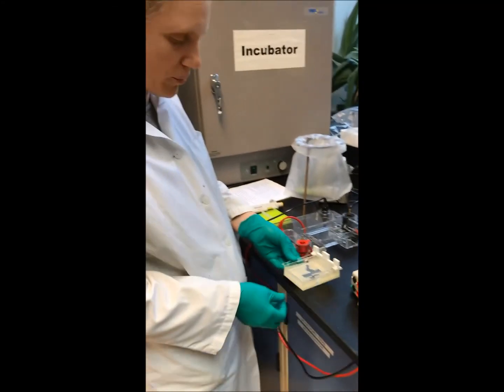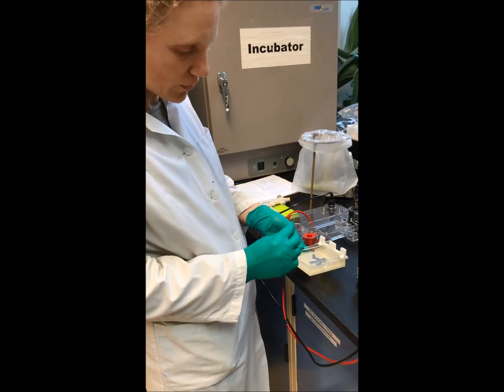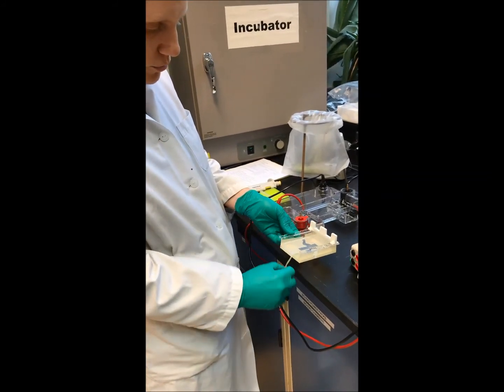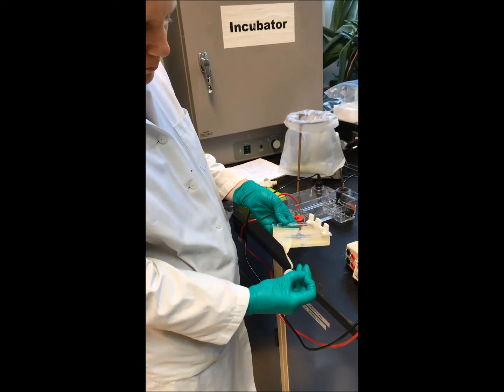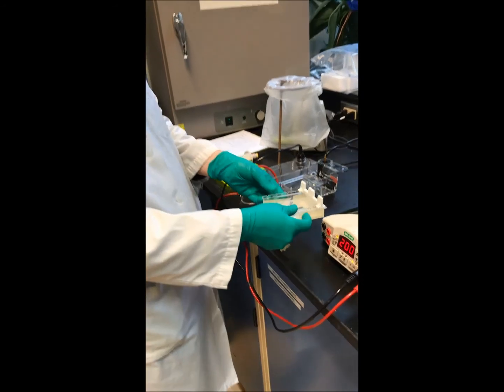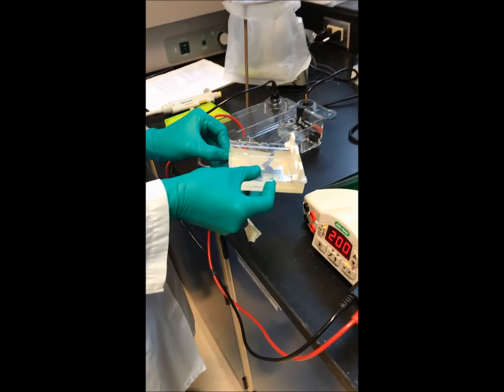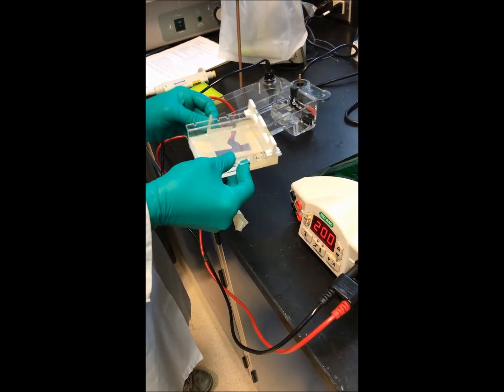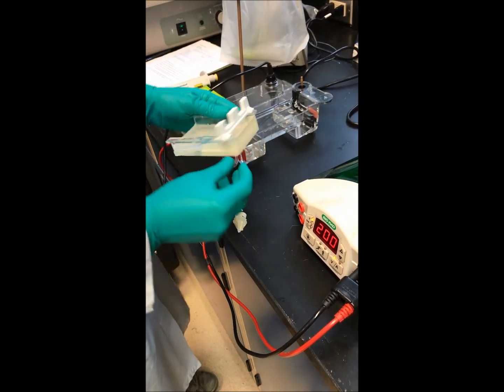Okay, so the gel has been poured. It's a jello-like substance, a rectangular slab, and to pour it we need to prepare the bed, the gel bed, so we have to put tape. Now I'm removing the tape so that the current can pass through it once we place it in the chamber with a buffer. Removing the tape.